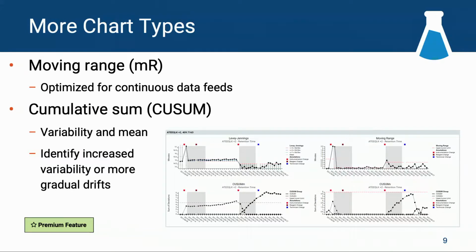You might want to dial that back a little bit yourself, depending on the variability you have, but that's the default view. These other plots give us visibility into, say, a more general trend that we haven't reached 3 standard deviations, but we've got a gentle slope going up that's going to get into trouble, and ways to flag that in a more systematic way than squinting at your plot and saying, I don't know, does that look bad to you?